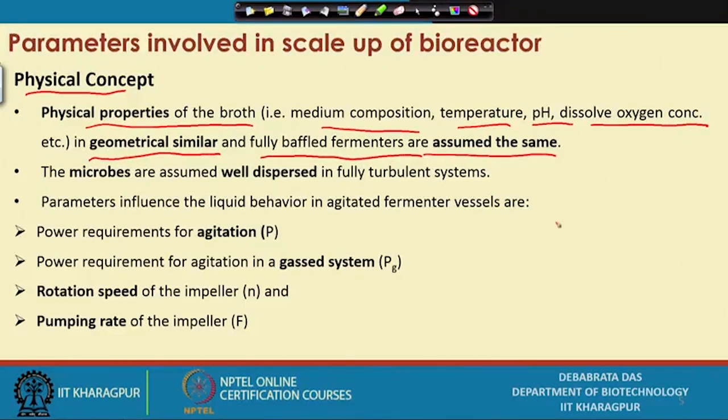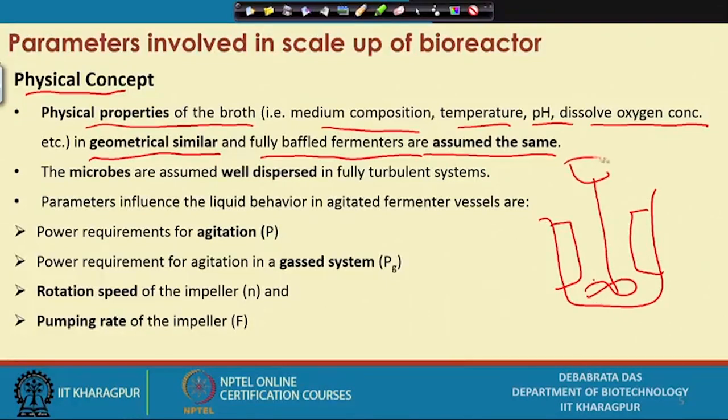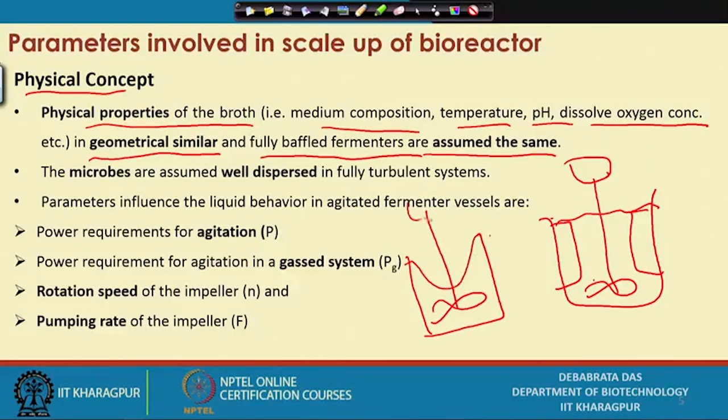I told you, you can remember, that most of the fermenters require baffles. Why do you require baffles? Because if you don't have baffles, then there will be vortex formation. Here, there will be no vortex formation. But if you have this stirrer here, then you will find this kind of vortex formation.